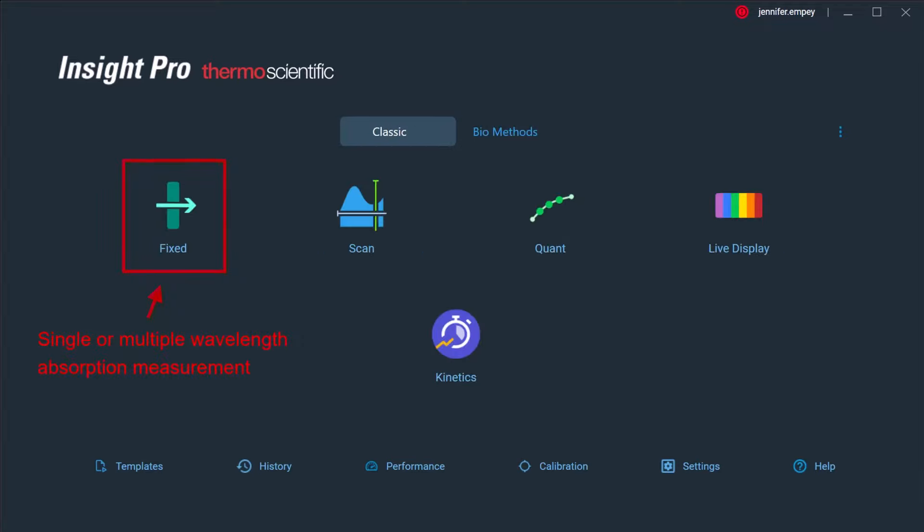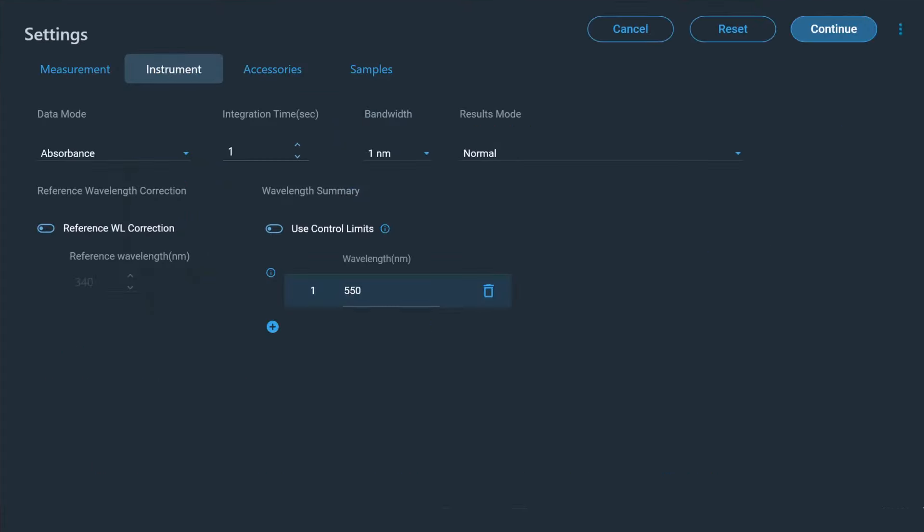The fixed application is used to select one or multiple wavelengths at which the absorbance or percent reflectance of the sample can be collected. The software enables users to choose the wavelengths of interest and integration time. When Insight Pro is used with the Evolution Plus or One Plus, bandwidth can also be adjusted.